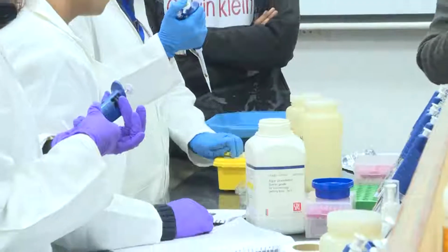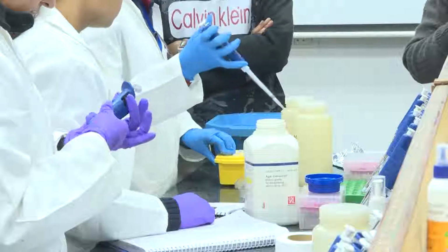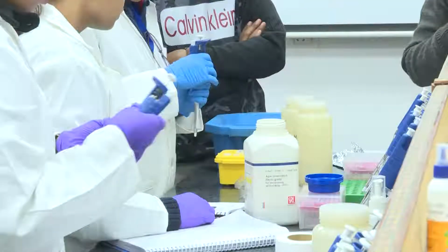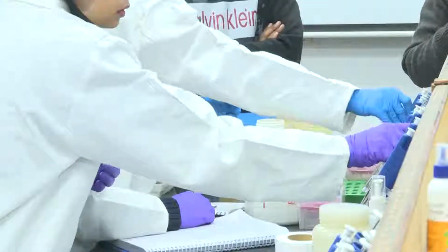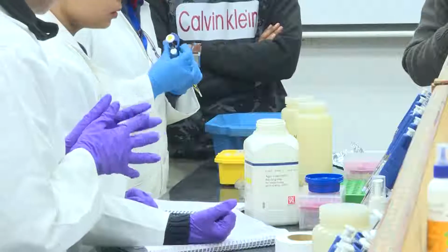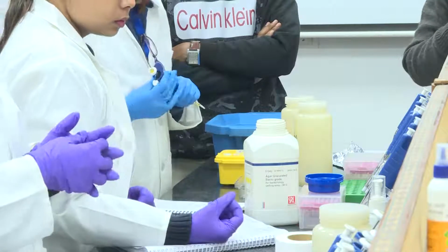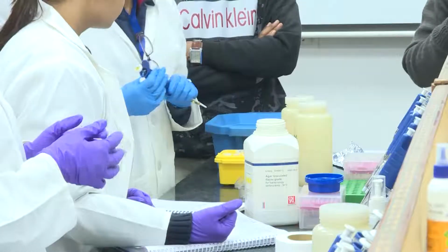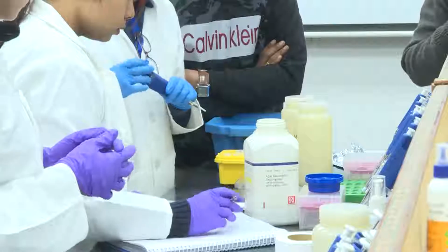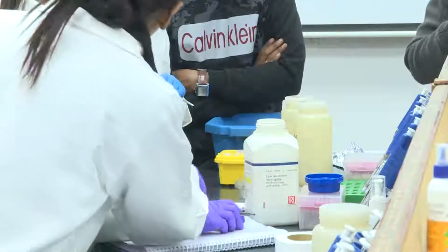That is another, or rather an advanced, version of real-time quantification of DNA or PCR amplicon, which improves the reliability and accuracy of your quantitation. Right now it costs about 60 lakhs. Like your PCR machine, when the cost comes down, we will be able to see many of those machines in several laboratories. Okay.